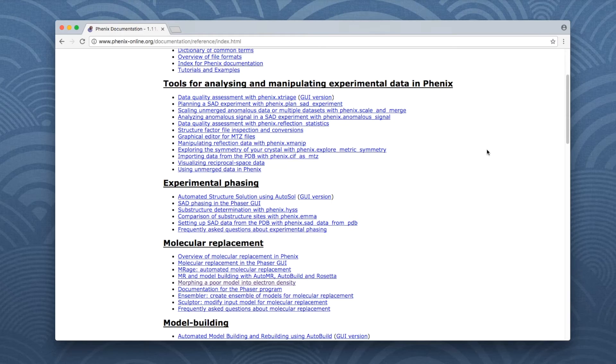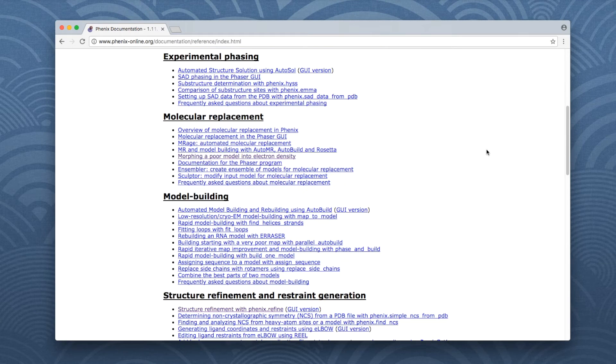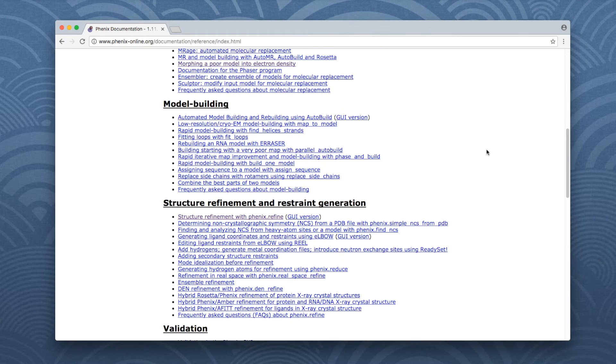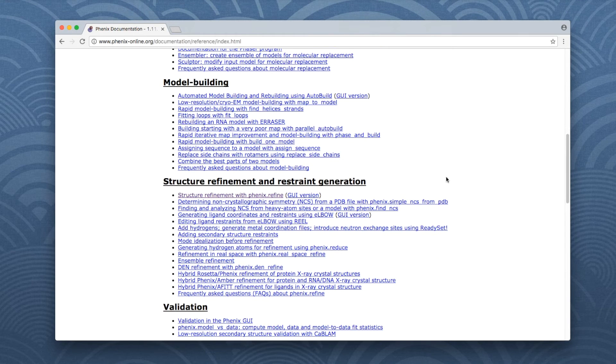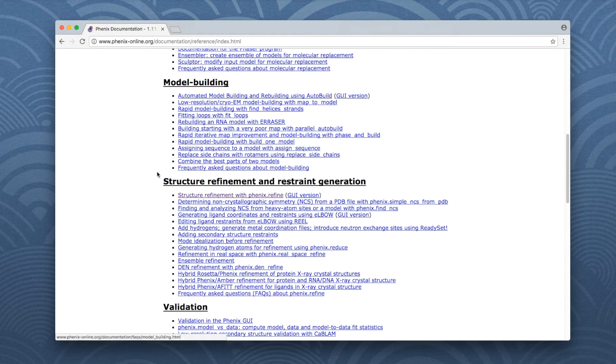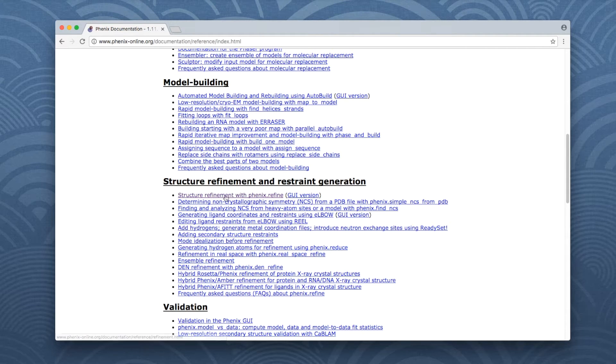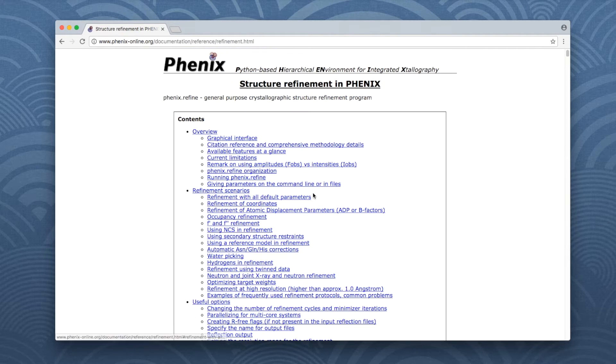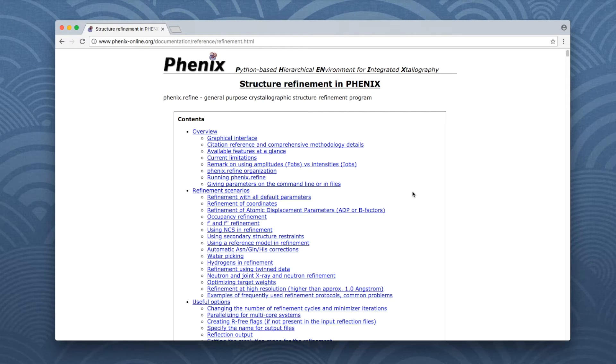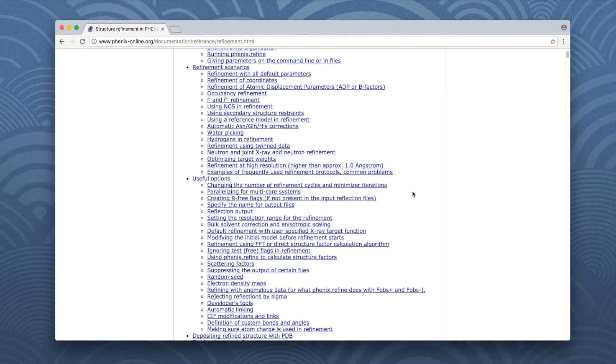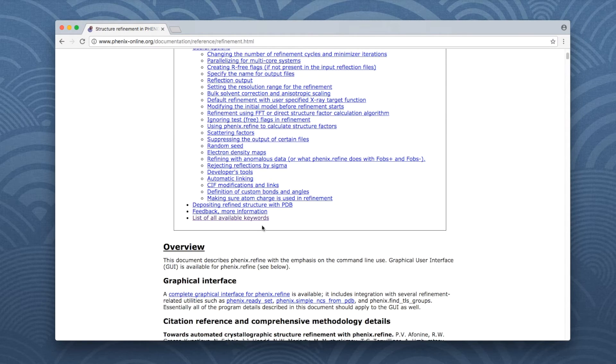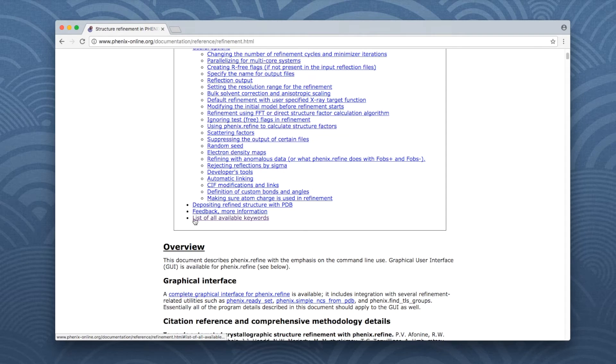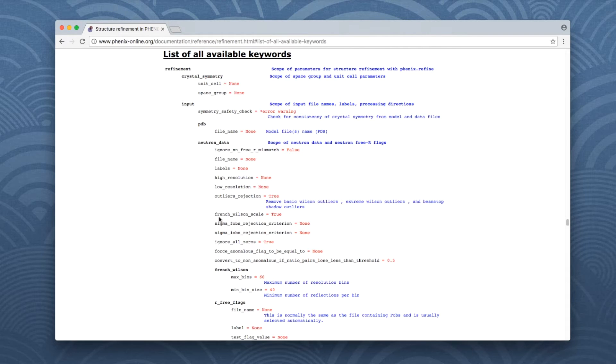The page which just opened contains links to the documentation pages of all Phoenix tools. Scroll down to Structure Refinement and Restraint Generation and click on the first link in the list. This opens the documentation for Phoenix Refine. Scroll down the table of contents to find a link for the list of available parameters at the end. Click to jump to the list of parameters.